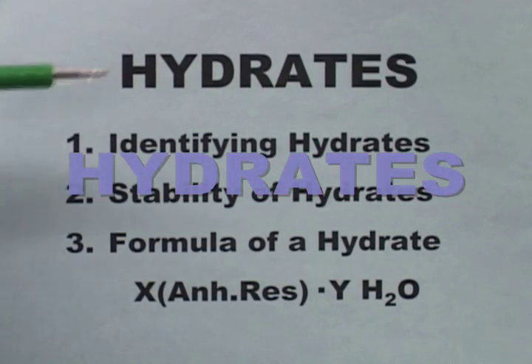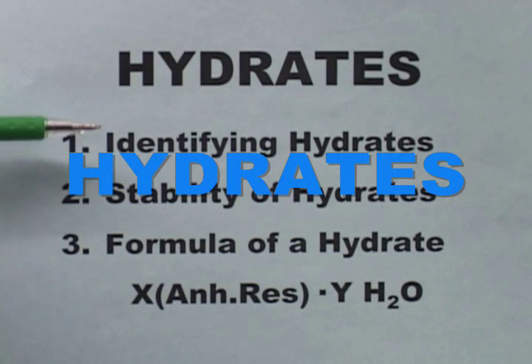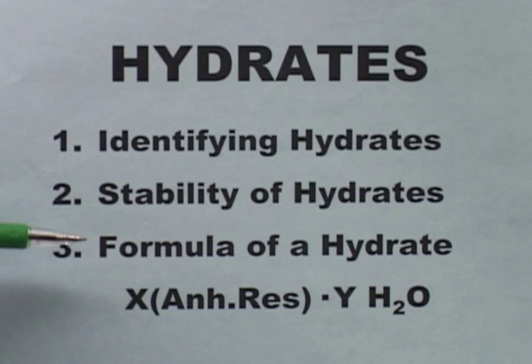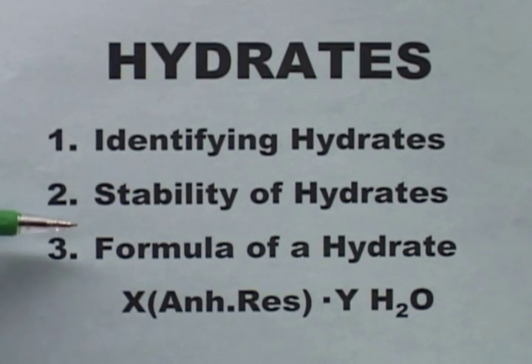Welcome to Hydrates. In this experiment, you'll learn how to identify hydrates, you will study the stability of hydrates, and you will also actually determine the formula of a hydrate.